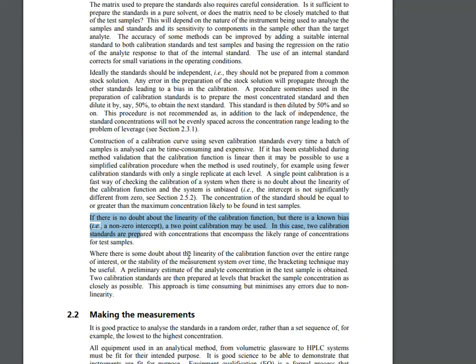This is in very limited circumstances with very simple pieces of equipment. We never really do 2 calibrations for a complex multi-thousand-dollar piece of equipment. These would be things like sometimes your ISE probes, your ion selective electrodes, such as pH probes, fluoride probes, chloride probes, soil moisture probes. Very simplistic in nature. Those are 2 points and those are okay. We don't need 7 buffers to make my pH probe work properly.